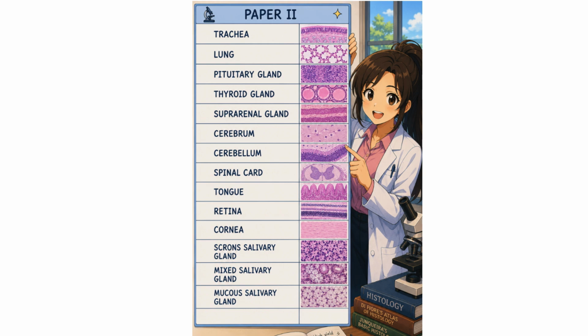Coming to nervous system, cerebellum, we have three layers. The mnemonic is MPG: molecular, Purkinje layer, and granular layer. First is molecular, M, then Purkinje layer, and granular layer. Outer molecular layer is pale with few cells. Purkinje cells are large flask-shaped neurons in a single row, which is the key identification feature in cerebellum.